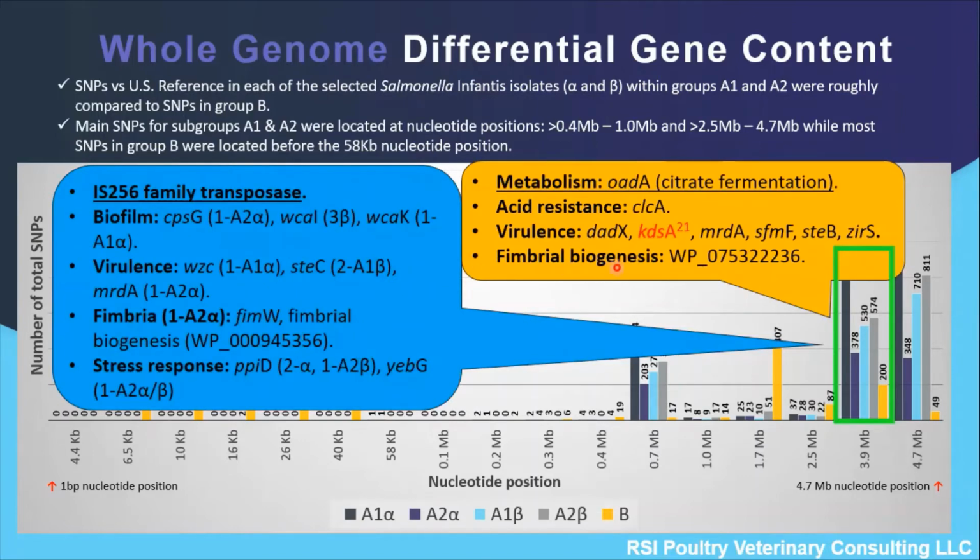I would like to focus on this gene, the KDSA gene. This gene functions in lipid A maturation and has lost the stop codon of a normal gene. This mutation may alter gene functionality and the production of a normal LPS.